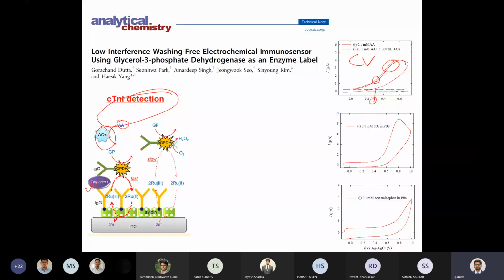Now, if we add the ascorbate oxidase, 5 units per ml, some concentration, you can see this one will go down like this blue one. It means if you add ascorbate oxidase, this effect will be removed. So you will not get any contribution, meaning your background will not be affected by the ascorbic acid. That's why we use such kind of chemical.